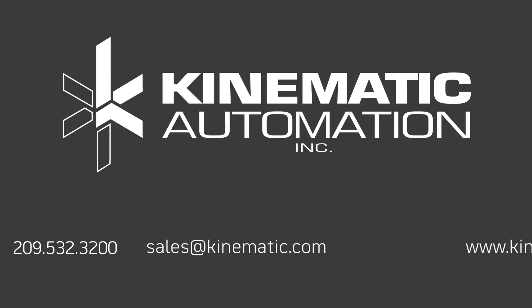To learn more about the matrix line of systems, call, email, or visit Kinematic online today.